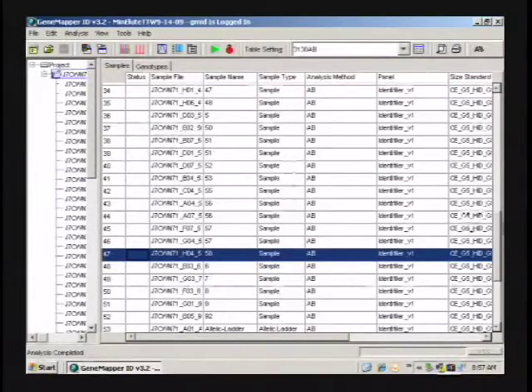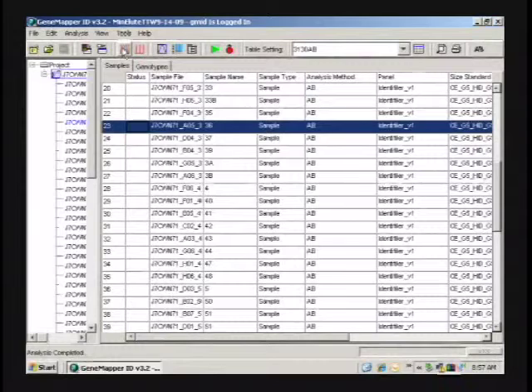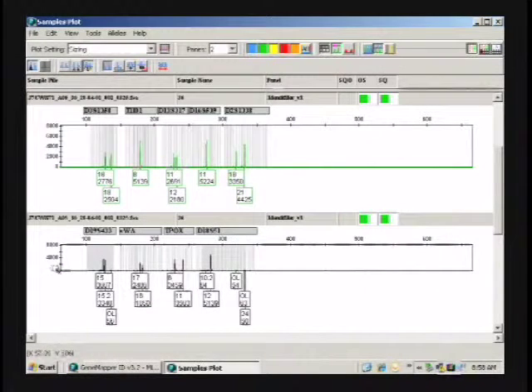And this was 58, the other one was what, number 36? Yes, which I believe would have been a 0.1. Okay, so number 36, this was a 0.1 nanogram sample, and you can see the peak heights are a lot higher. I mean, this is like 3,000 nearly RFUs, and this is with the chi-cubes. This is actually really good data.